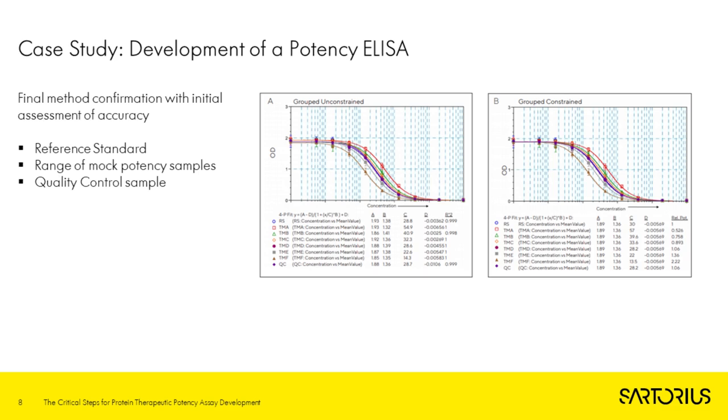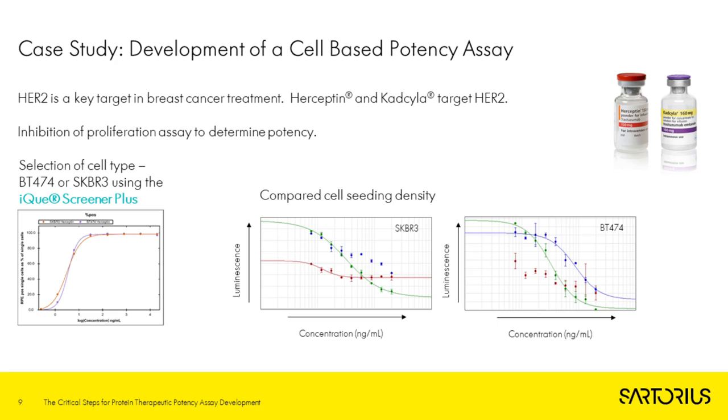So from our DOE, we can quickly identify the best parameters, and this allows us to move forward to optimize the dilution series before running an initial assessment of the accuracy of the assay. And this assay was then extensively qualified to determine the method performance.